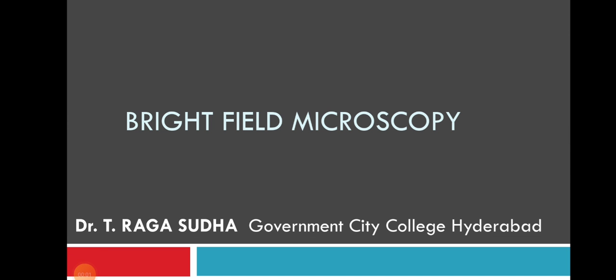Good morning, students. Today's topic is bright field microscopy and dark field microscopy. We will begin with bright field microscopy. The fascinating world of microorganisms would have remained unknown had the microscope not been invented.